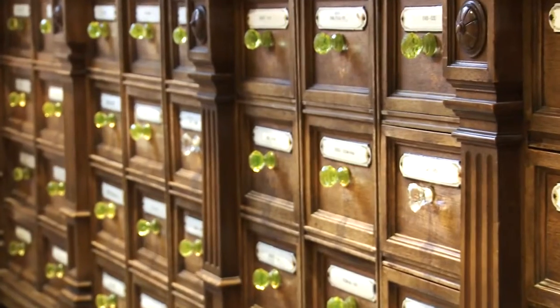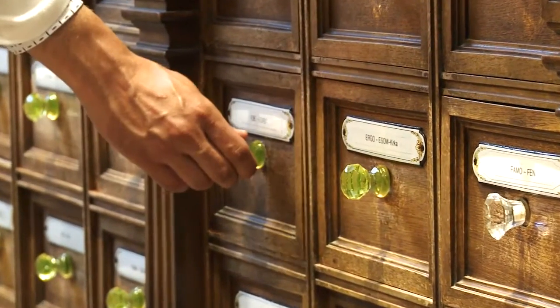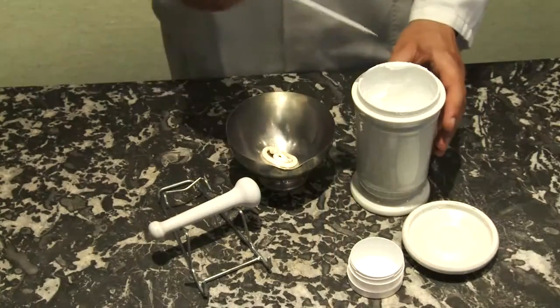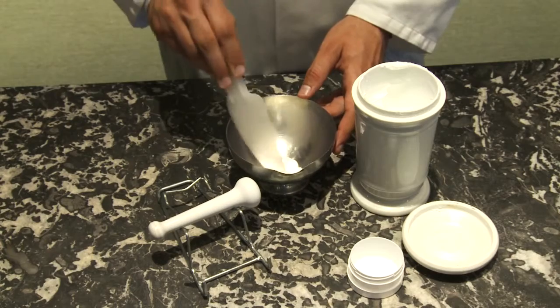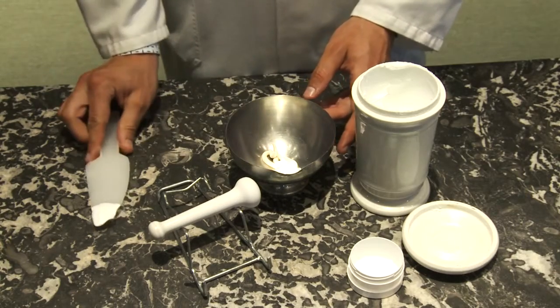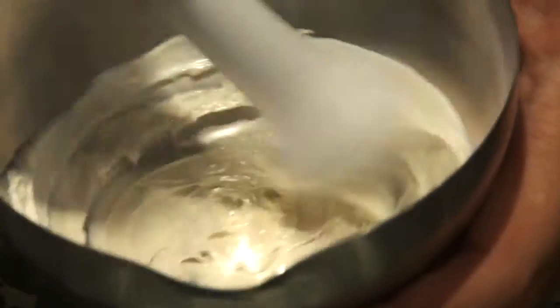A formulation's main components are excipients and active ingredients. There can be more than 20 excipients in one single formulation which have to be analyzed for purity and stability in combination with the API.